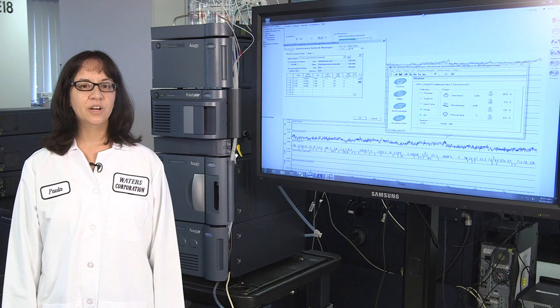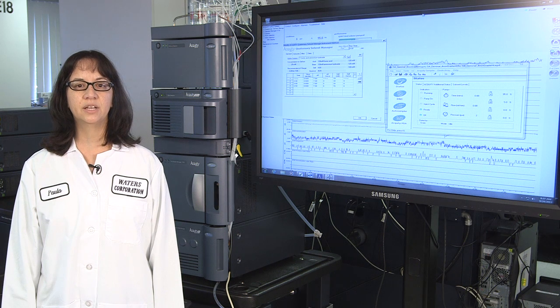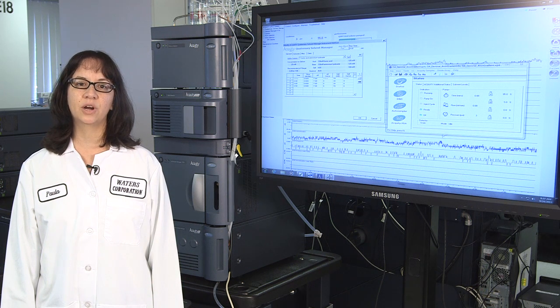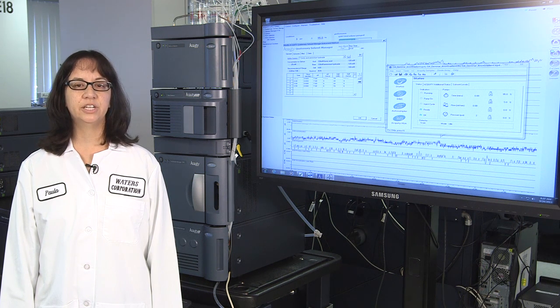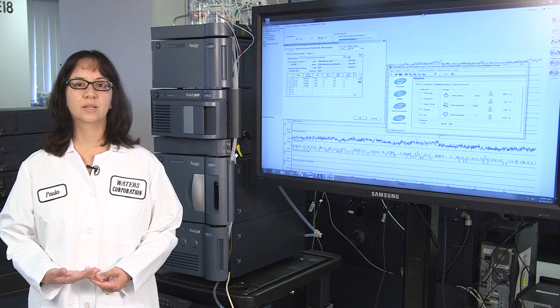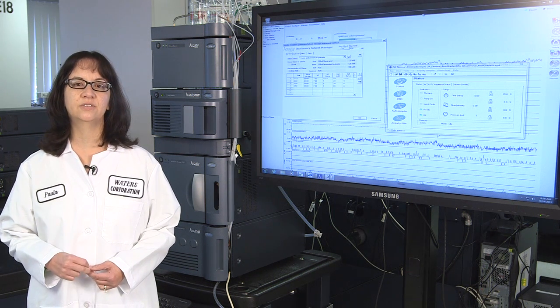I work in the separations laboratory, testing new technologies and talking with chemists about the challenges you face using analytical instruments. One of my current projects focuses on the ways to make the development of chromatographic separations more effective and more efficient. Over the years, we've all become very good at screening through organic solvents and reverse phase columns with different properties to achieve our targeted selectivity.